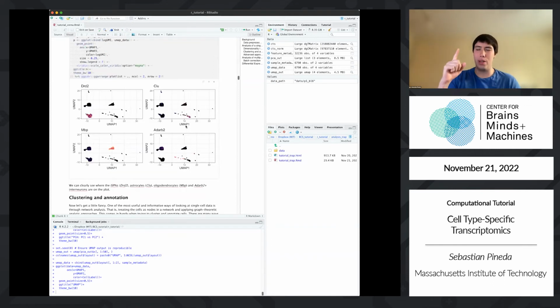Yeah, you need to know what your markers are, and you need to know what cell types are present. And you don't always know these things, right? Especially if you're trying to find de novo markers or you're trying to identify new cell types. This can be a challenge. But this is sort of the naive approach. And here we can start assigning identities to each blob of cells.